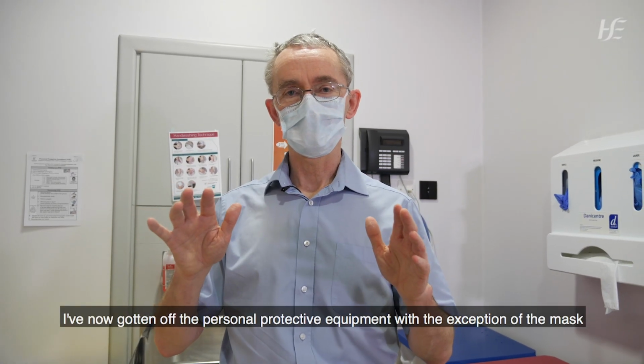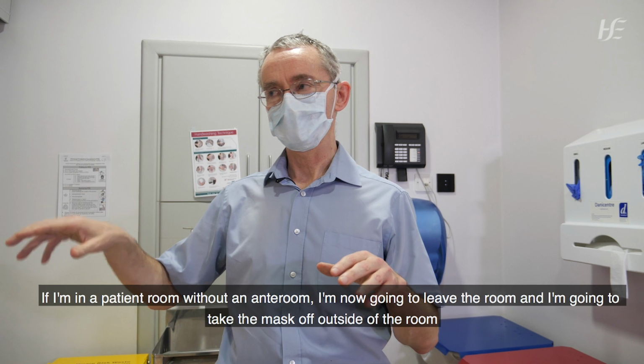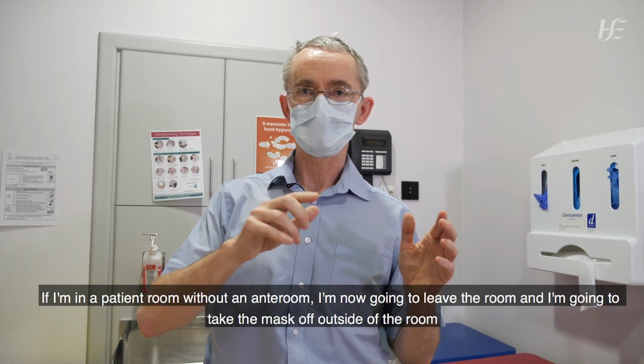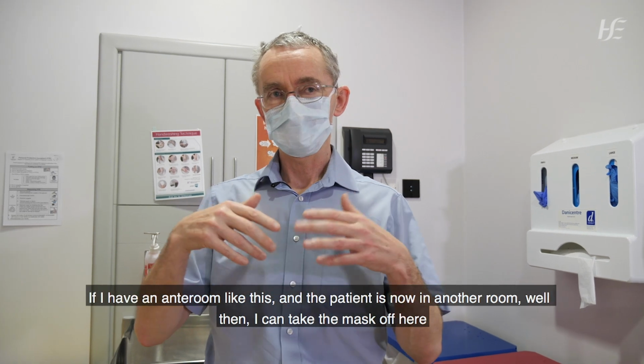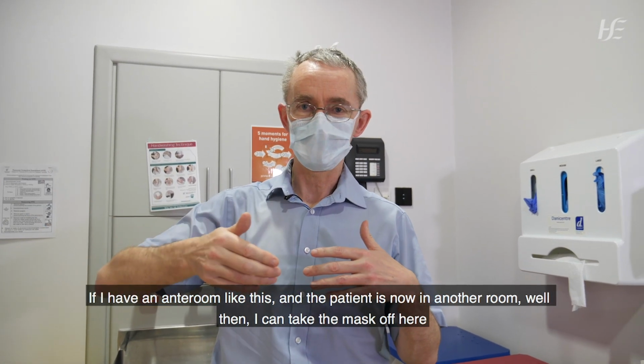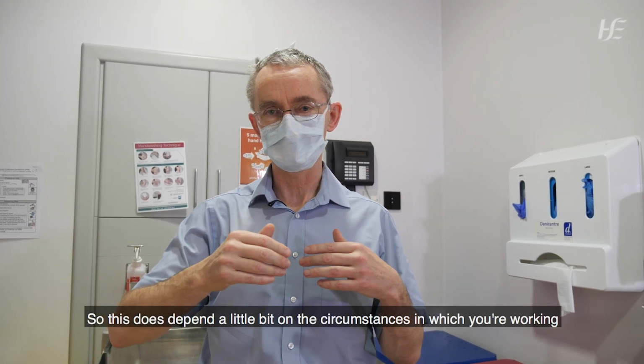I've now gotten off the personal protective equipment with the exception of the mask. If I'm in a patient room without an anteroom, I'm now going to leave the room and take the mask off outside of the room. If I have an anteroom like this and the patient is now in another room, well then I can take the mask off here. So this does depend a little bit on the circumstances in which you're working.